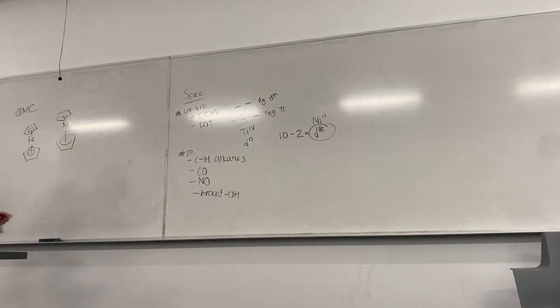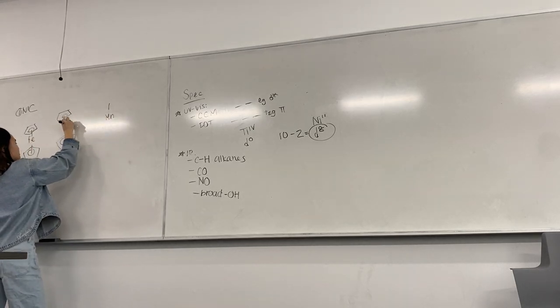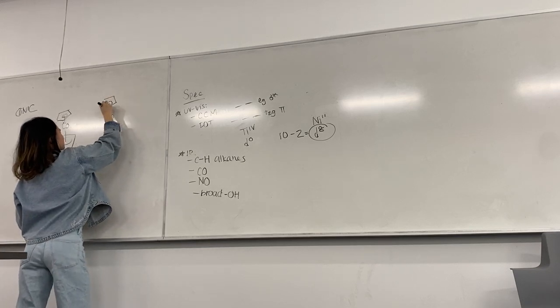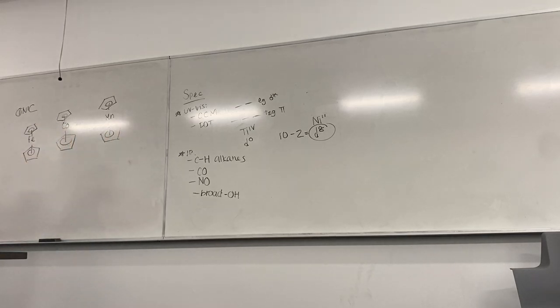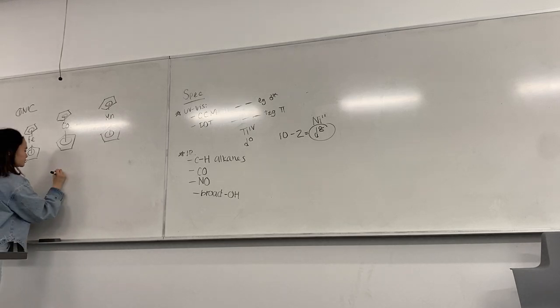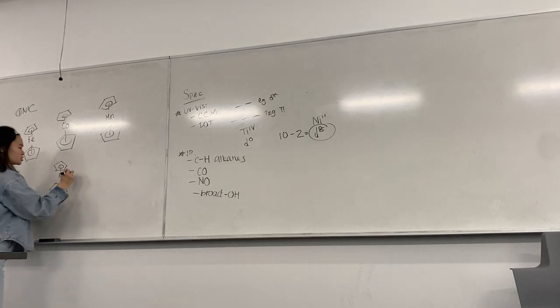And let's say we got this. Actually, let's swap this out for a cobalt. Okay, so in lab, we synthesized nickelocene. I didn't put it on here, but it's a metallocene with a nickel in the middle. And one of the reasons we use an inert atmosphere is because it's air sensitive, right? So nickelocene, if we do the d electron count, it gives us 20 electrons.